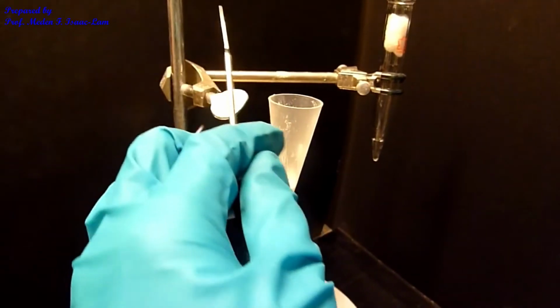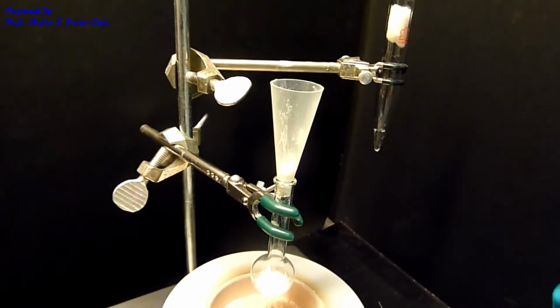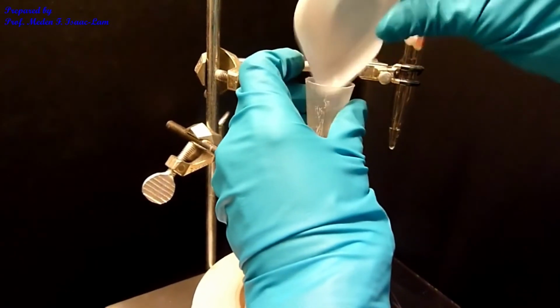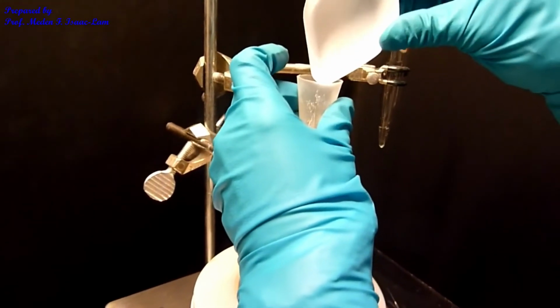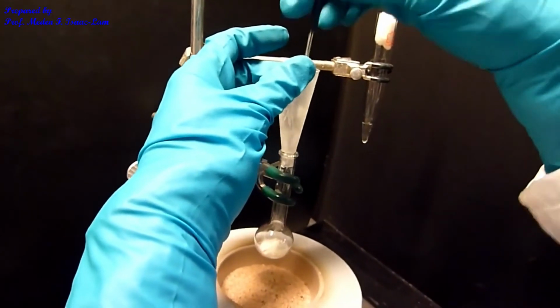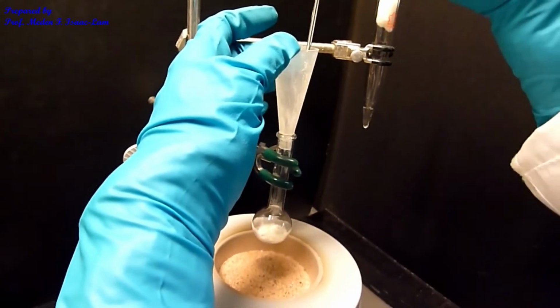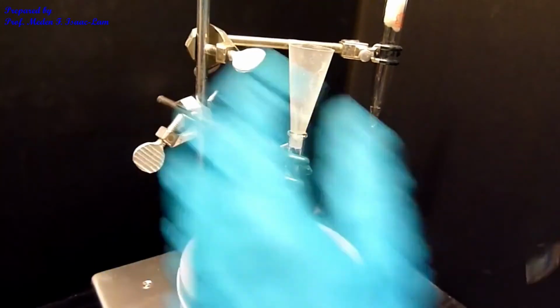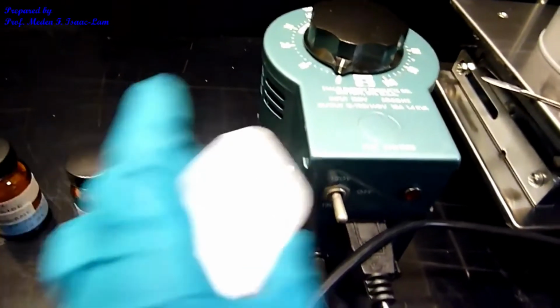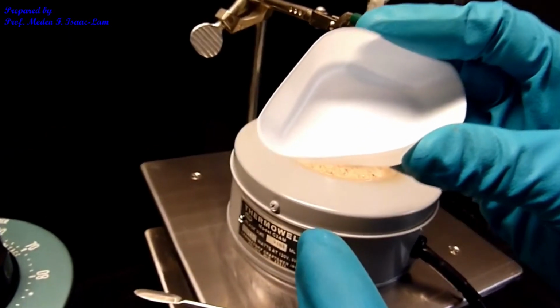I use a funnel because the mouth is small. Otherwise, it might spill. And then I'm going to push it. And then I'm going to add the 10 milligrams of the benzoyl peroxide, a very small amount.